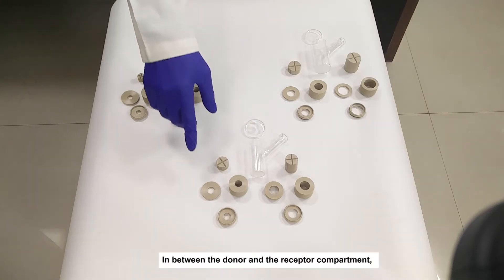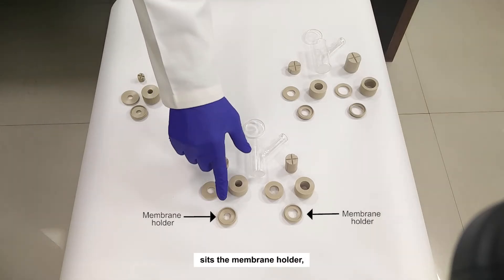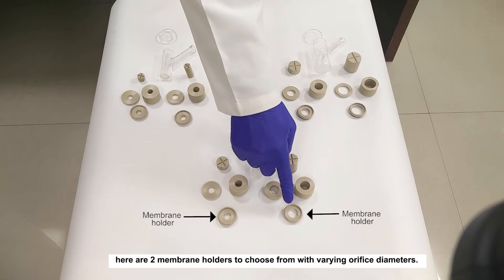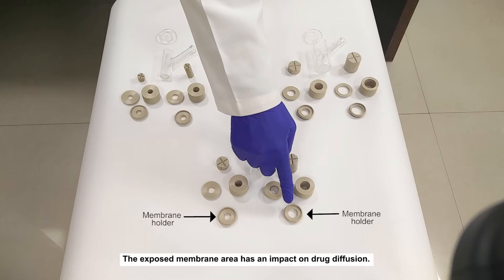In between the donor and the receptor compartment sits the membrane holder, which retains the membrane. The membrane can be either natural or artificial, depending on IVPT or IVRT studies. For each cell, there are two membrane holders to choose from with varying orifice diameters. Different orifice diameters change the exposed membrane area, which has an impact on drug diffusion.